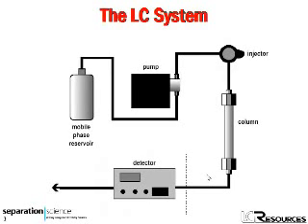Well, this is a sketch of a generic HPLC system. Of course, we've already covered the reservoir, the pump, the auto sampler, and the column, and today's topic is the detector. Now, we don't have a lot of time to go into a great deal of detail on every possible detector, but many of the detector problems and fixes are similar across different types of detectors, so you should be able to apply a lot of today's information in practical ways, no matter which detector you use.